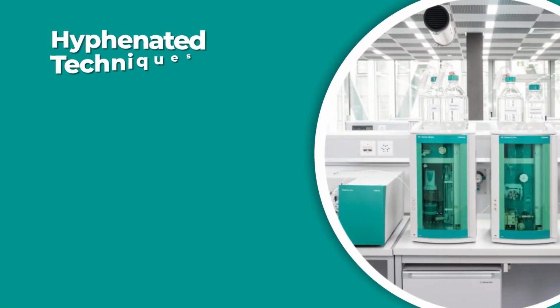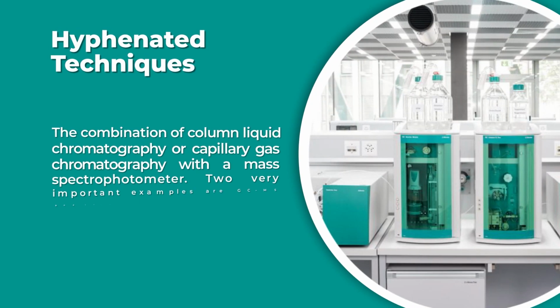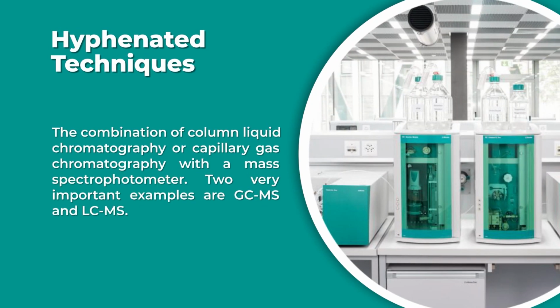For example, based on adsorption, solubility, partitioning, polarity, the components separate, having equilibrium between mobile phase and stationary phase. The results only indicate that this component may be present, but it does not confirm. In order to confirm it, hyphenated techniques are the best techniques.